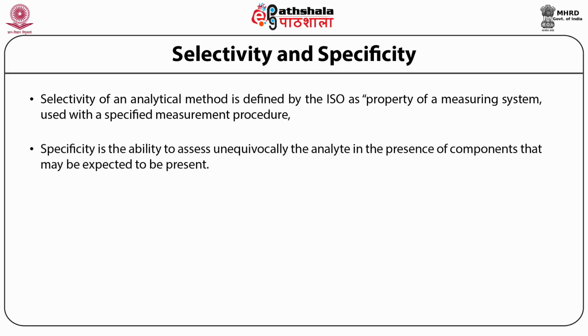Specificity is the ability to assess unequivocally the analyte in the presence of components that may be expected to be present.